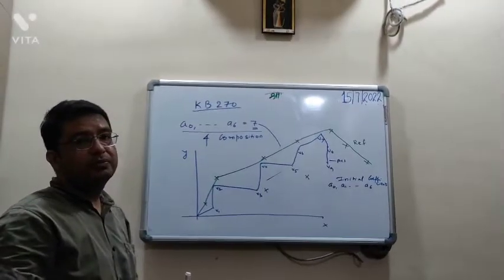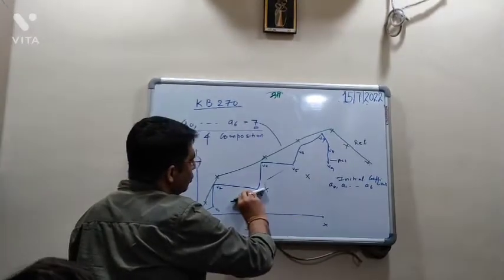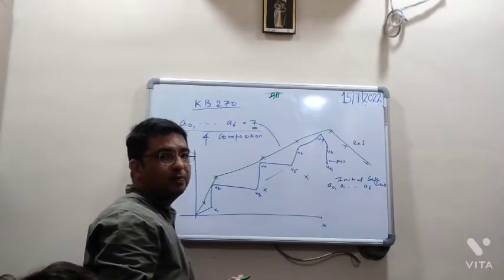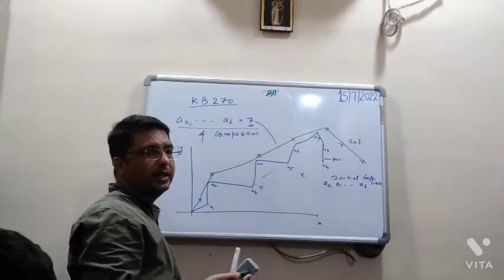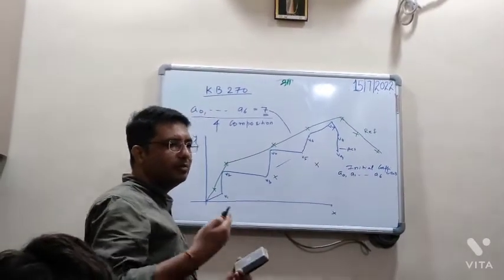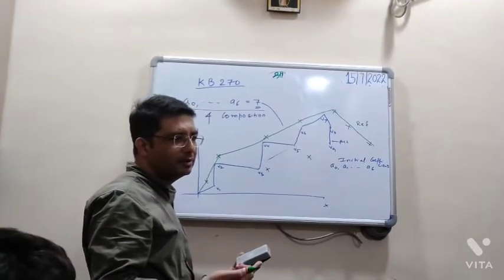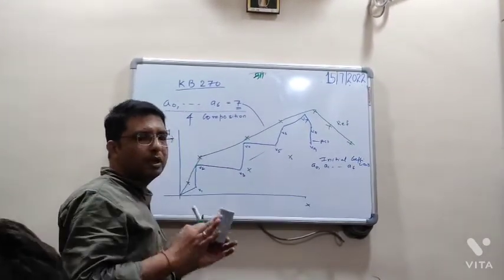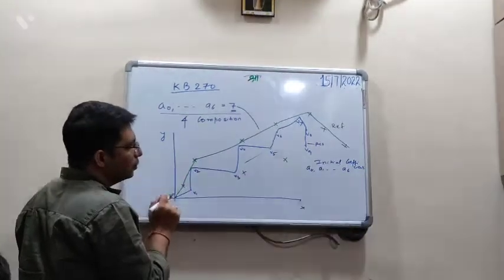Now what is our objective? This value must match with this standard value. That is our objective. We have to do actual mathematical calculations so that this should happen. But that is also not our headache. Who does it on our behalf? The machine. The machine is smart enough to do this calculation. We don't have to bother about it. Clear?